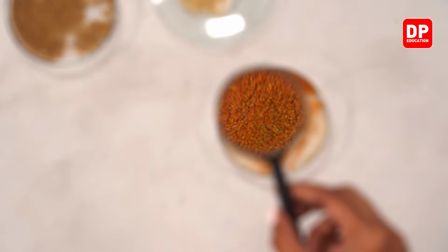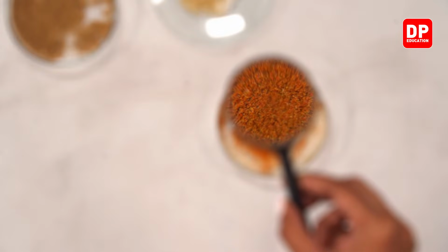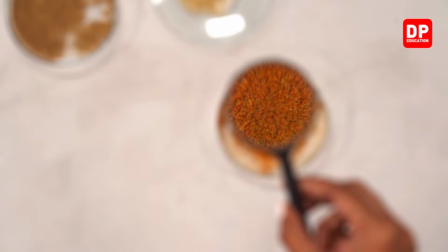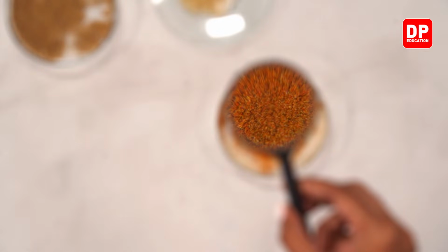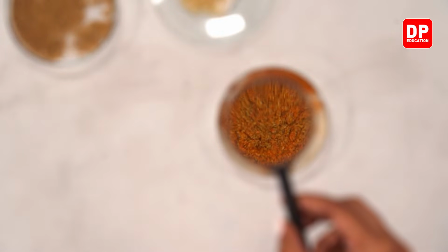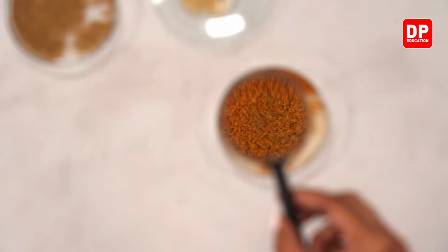That is chili powder. And if you observe very carefully, you can see light brown color powder is also there. That is the curry powder. And yellow color powder is also there. That is turmeric. And here and there you all can see white color. Okay, that is salt.